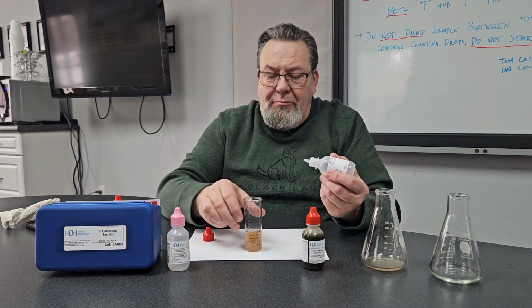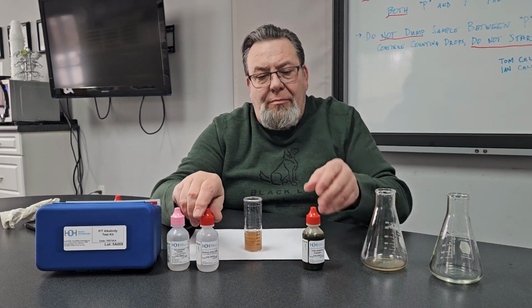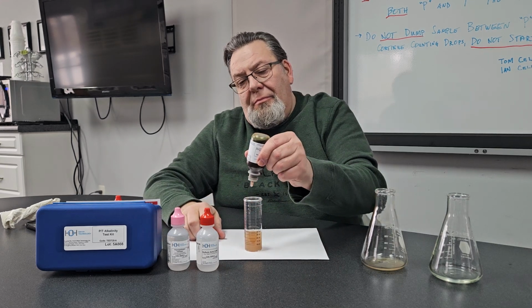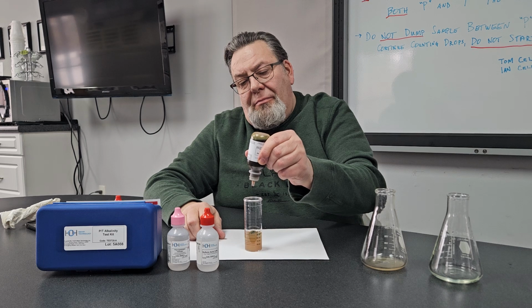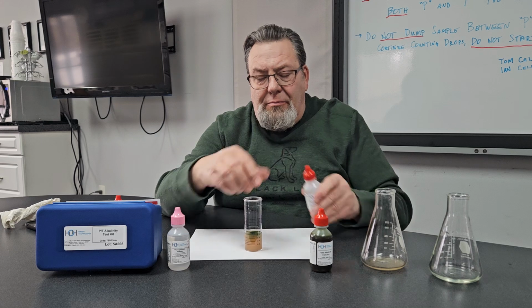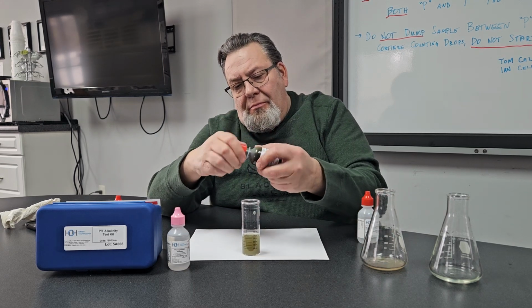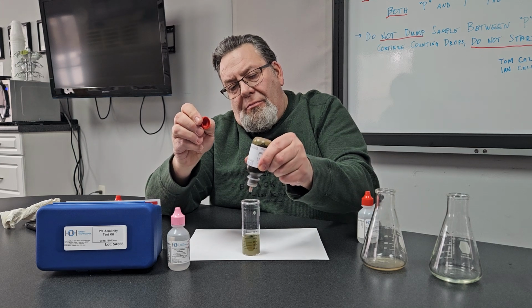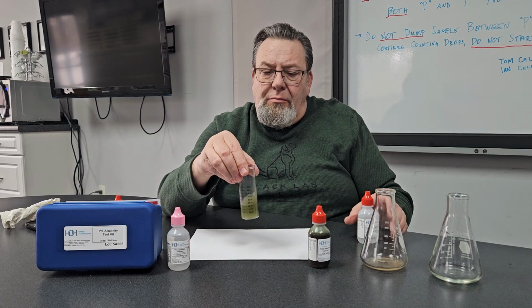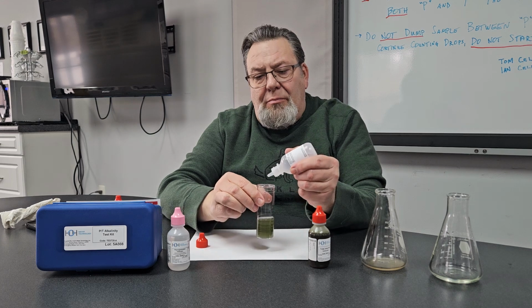That was 7 drops, or 350 parts per million, as P alkalinity. You'll enter this number into the cloud reports. 3 drops of the alkalinity indicator solution. In this case, the color is not real vibrant. I think we should add another drop or 2. We'll continue counting from where we left off.